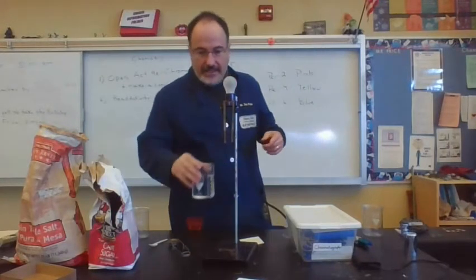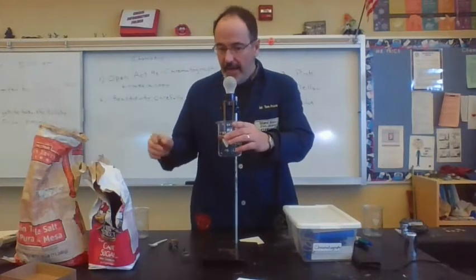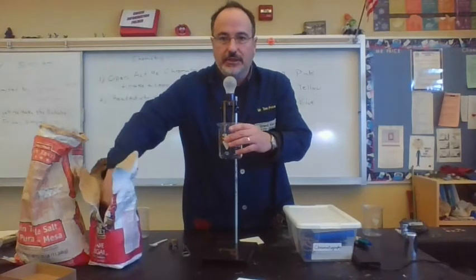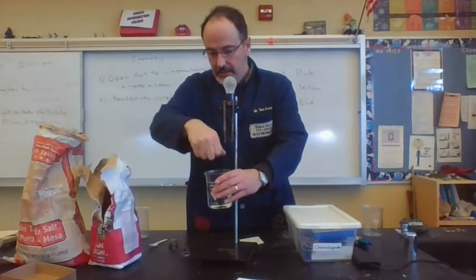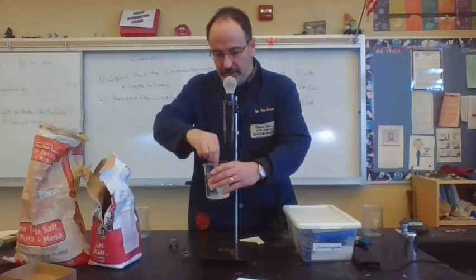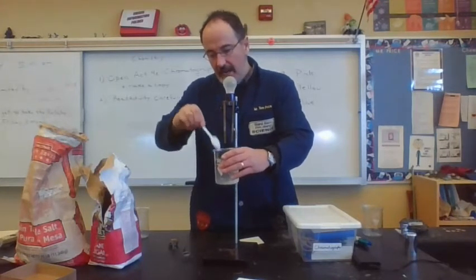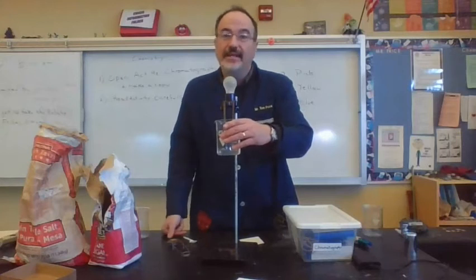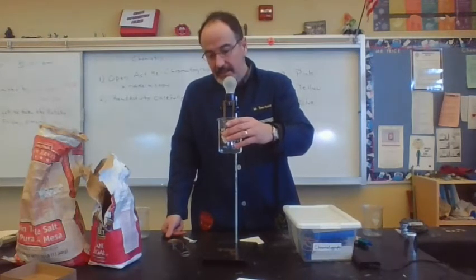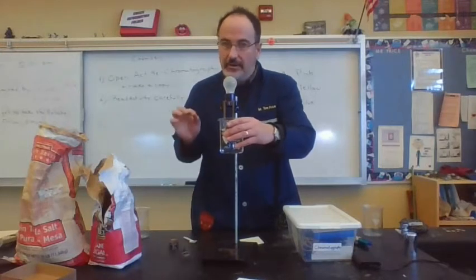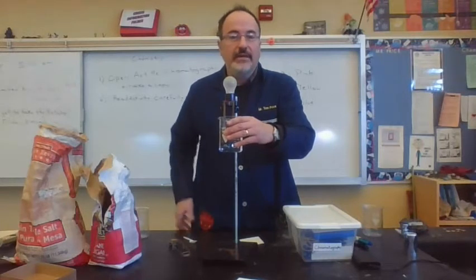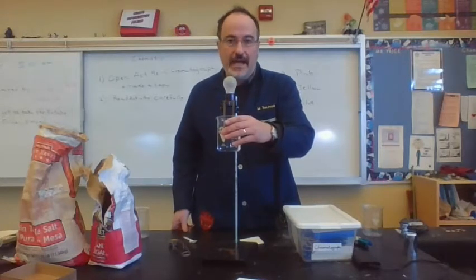So if I go ahead and take this pure water, I'm going to add a solute to it. First of all, I'm going to add a little bit of sugar. So I add some sugar in — sugar dissolves, make sure it gets all good and dissolved. And when I put it in, nothing. Sugar water does not conduct electricity, because even though it has particles that are dissolved and can move around, those particles, being molecules, do not have a charge.